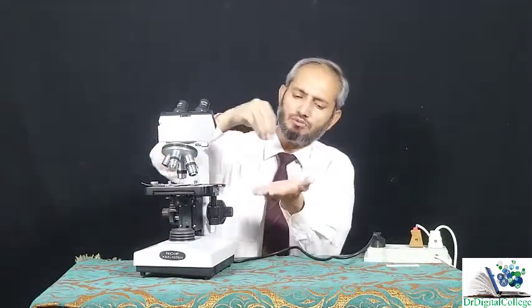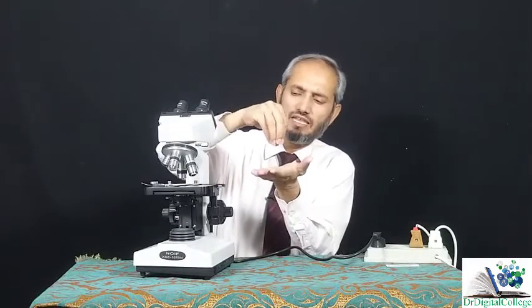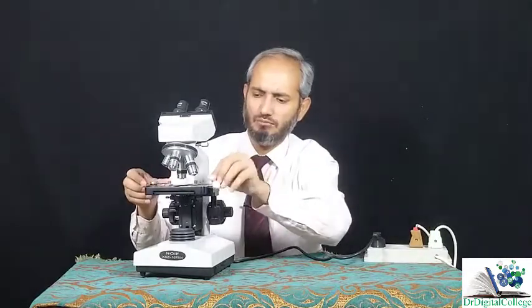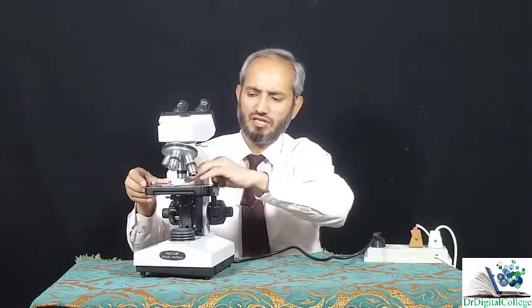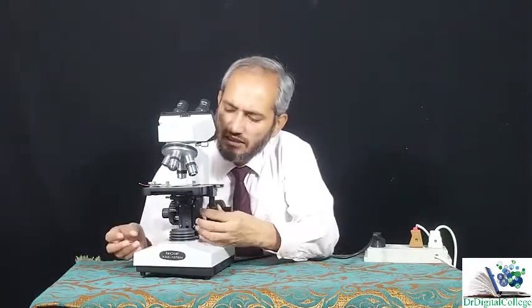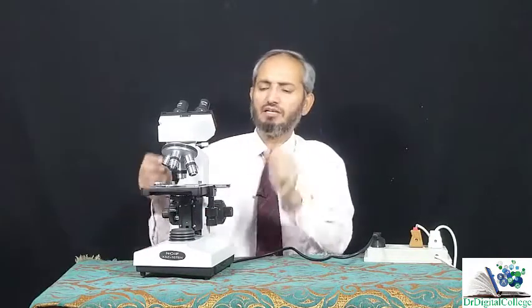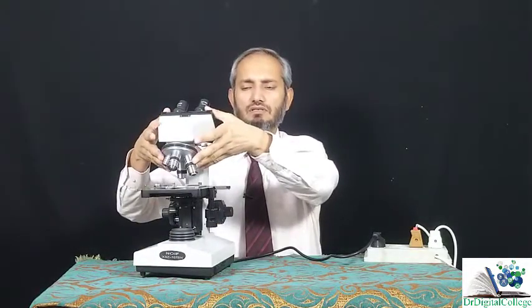By changing the position of this stage, you are actually changing the position of your object relative to the objective lens. This is the objective lens and here will be the object. Look at this. This is the slide and I am putting it here on the stage like this. And I will see that my object is exactly beneath the objective lens. Now, I can change the focus by changing the position of the stage. There are some microscopes whereby the stage is fixed and this portion of the microscope can be moved up or down. The whole of this tube can move down or up.